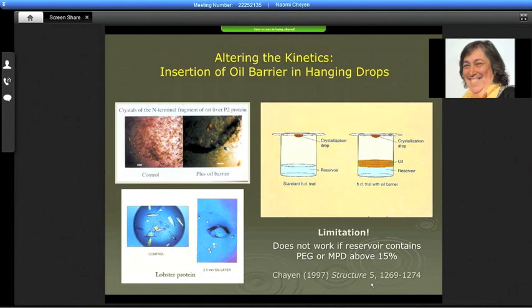If it is 1 ml, or 700 microliter of reservoir solution, you put half a milliliter of a mixture of paraffin and silicon oil, then put the cover slip on with a drop and let it cook. Instead of 24 hours, which gives you the bad crystals, it may take about 10 days to 2 weeks.